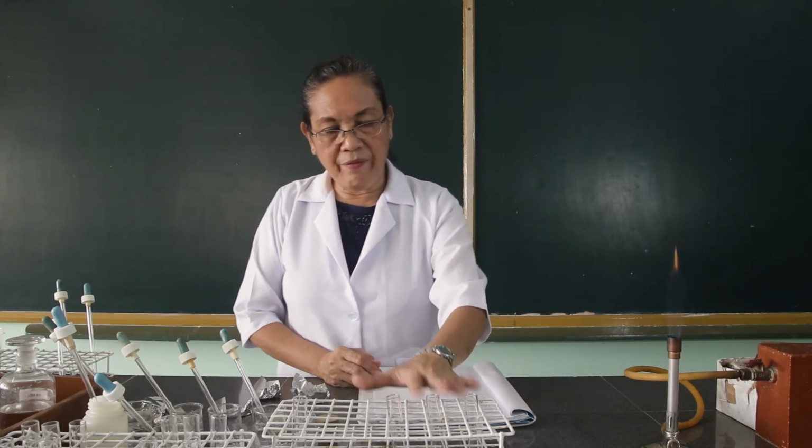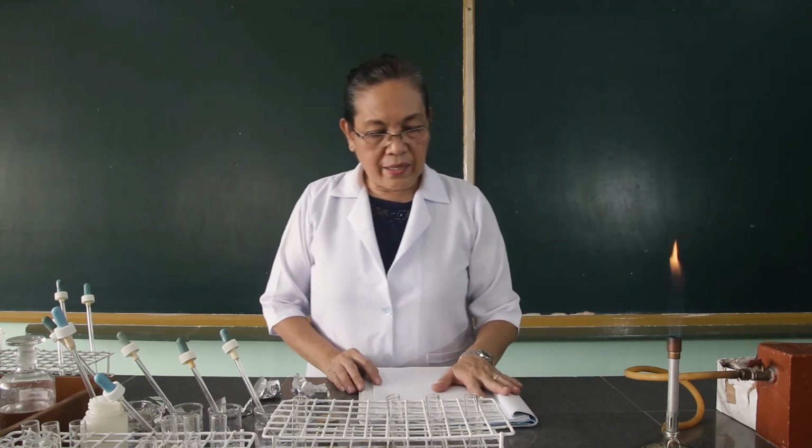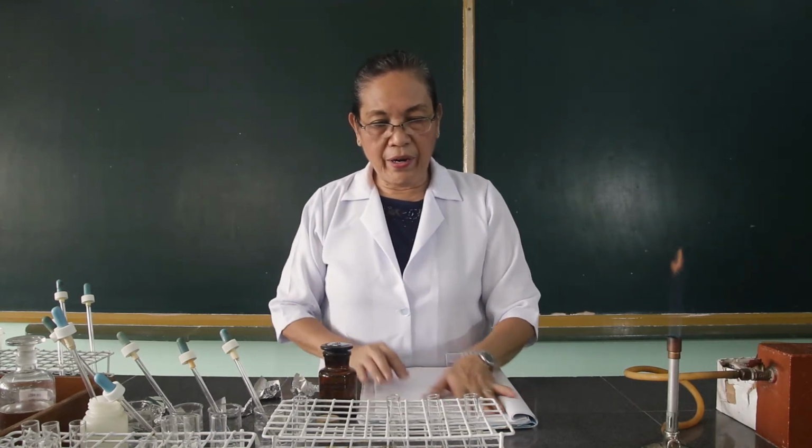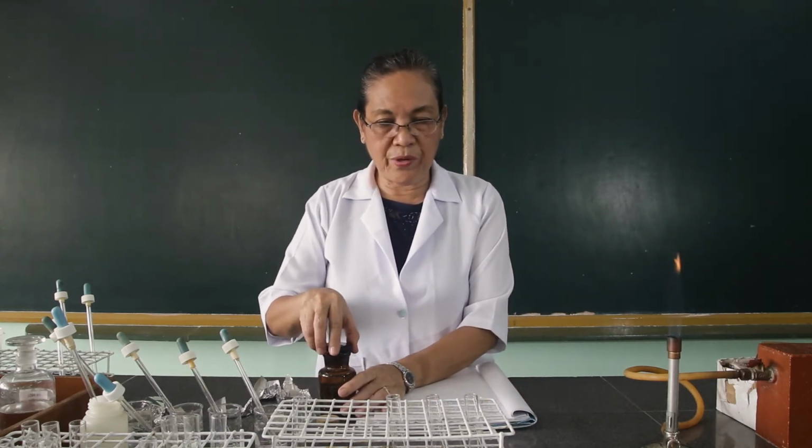And to each vial, we are going to add 4 drops of potassium chromate.